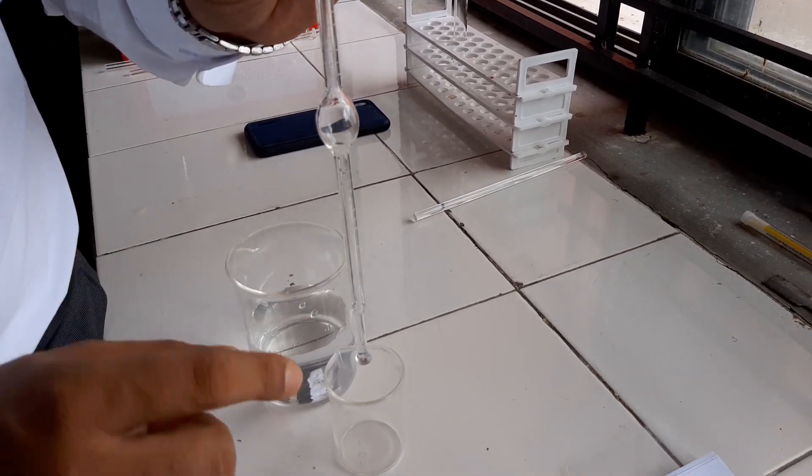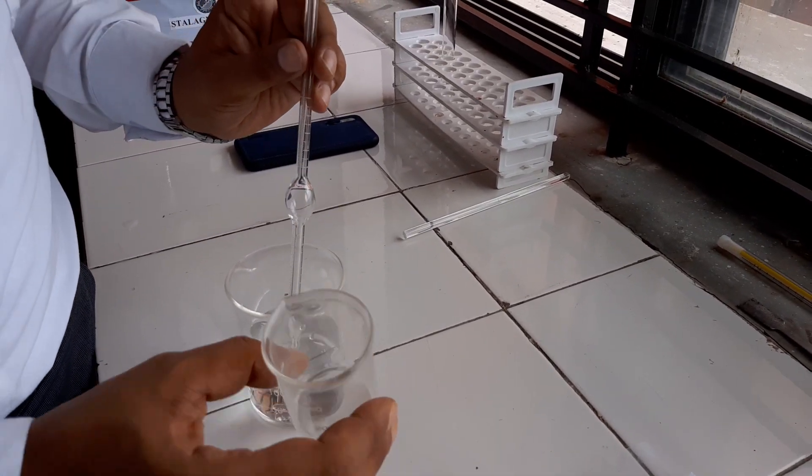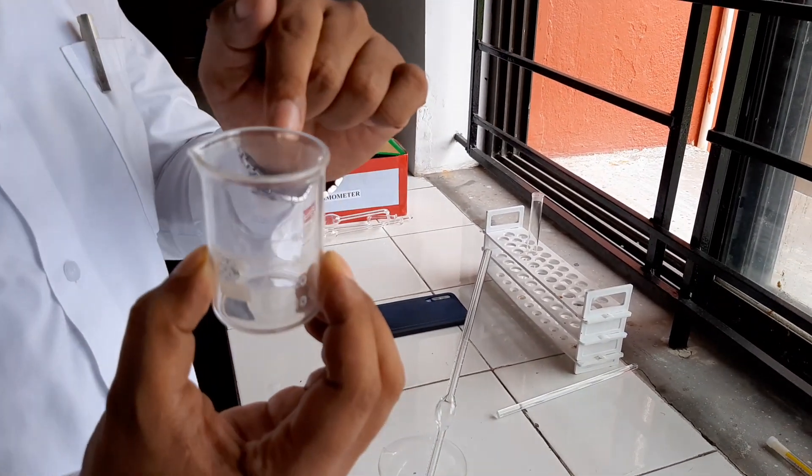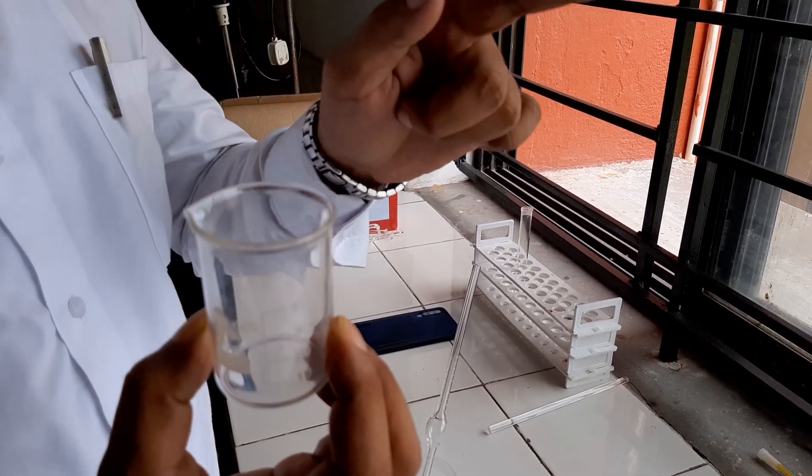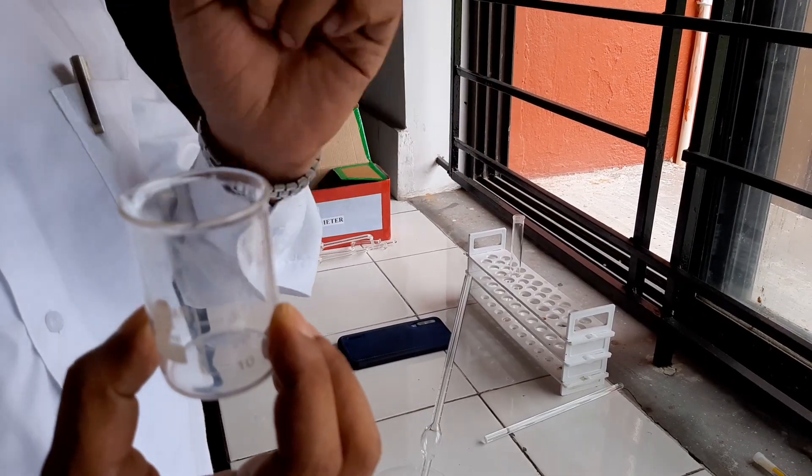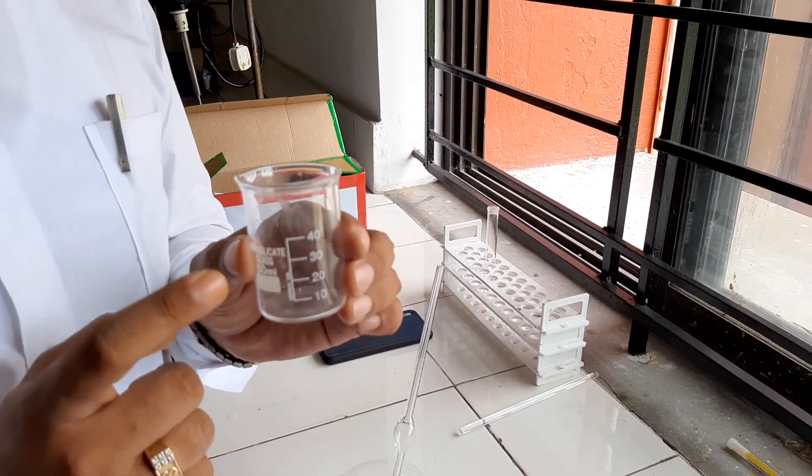After taking the liquid, you have to take the weight of empty beaker plus liquid. Suppose that is W2. So, W2 minus W1, you will get the weight of the liquid.